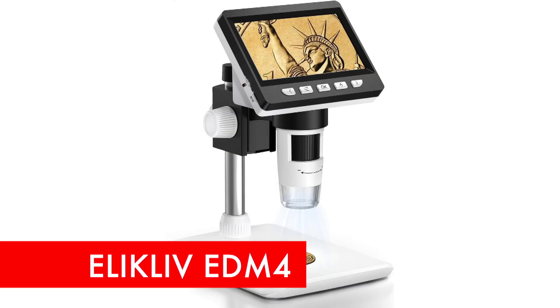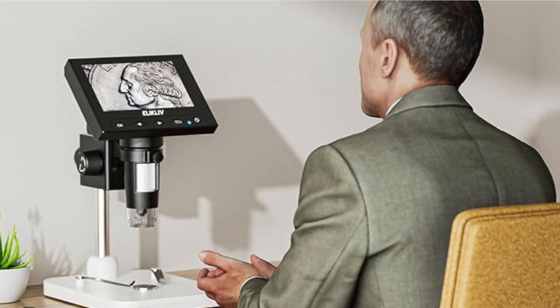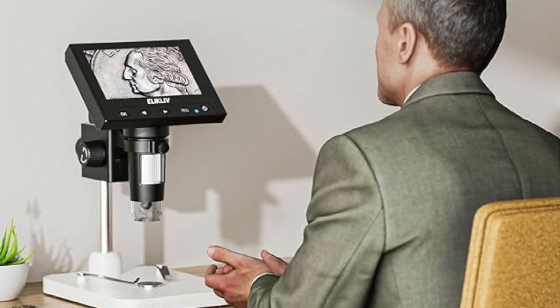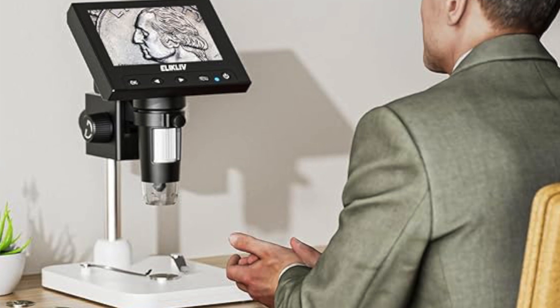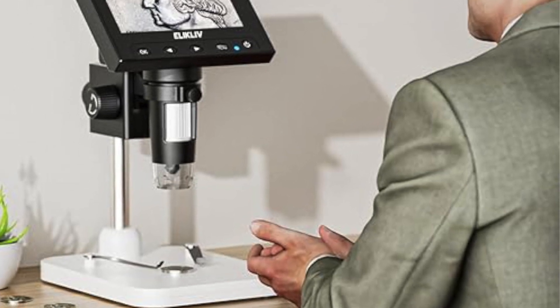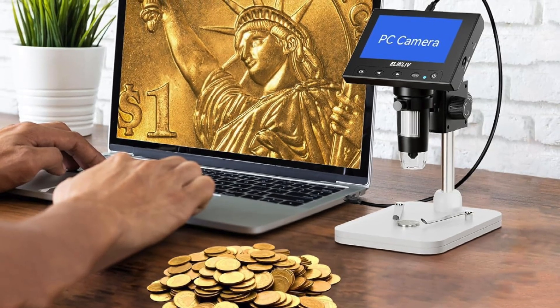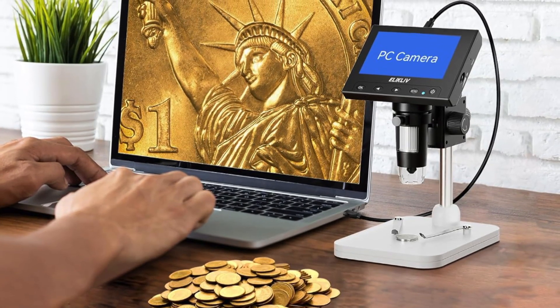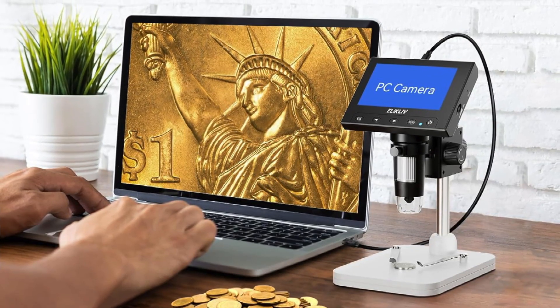First, the Eleclyve EDM4 digital microscope offers a powerful magnification range of 50x to 1000x, allowing users to examine intricate details of coins, circuit boards, jewelry, and more. Featuring a 4.3-inch LCD screen with 720p HD imaging, it delivers sharp real-time images and videos. The eight adjustable LED lights ensure optimal illumination, making it easy to observe details even in low-light conditions.